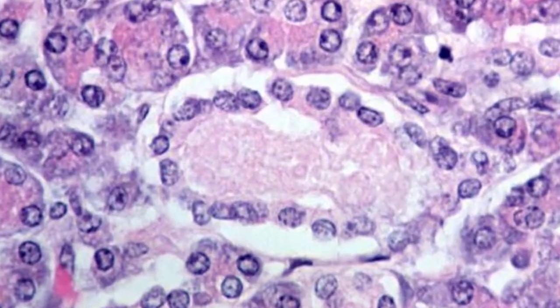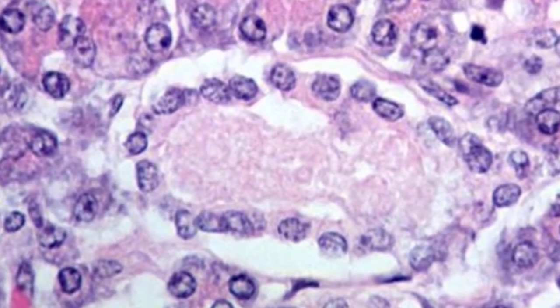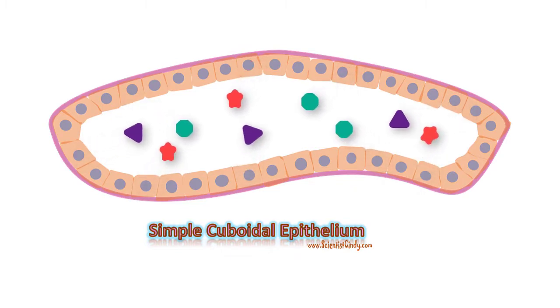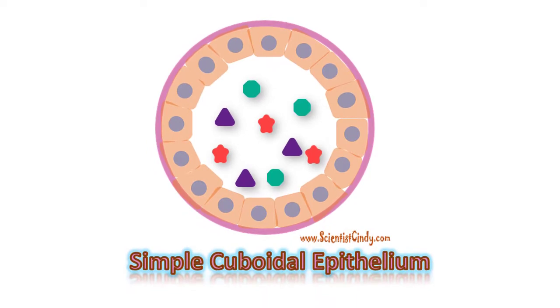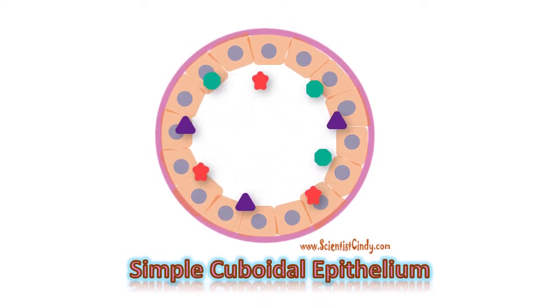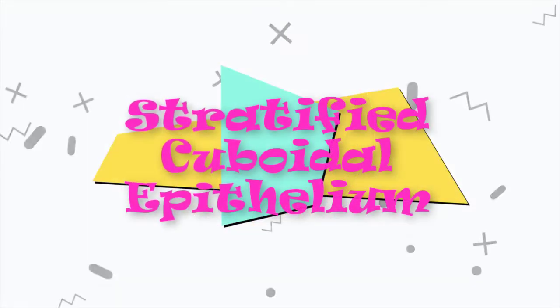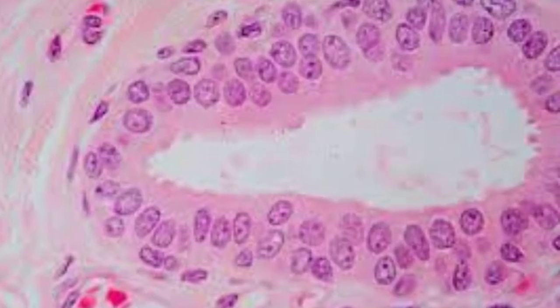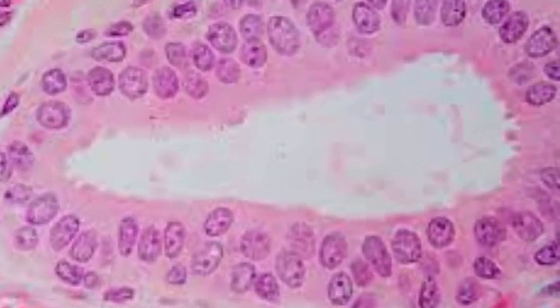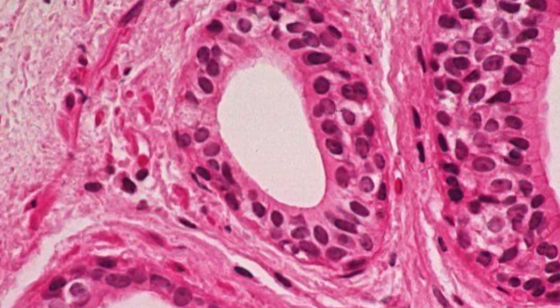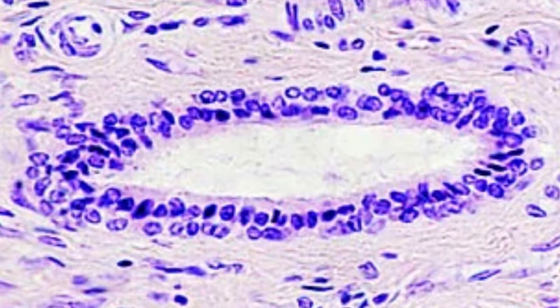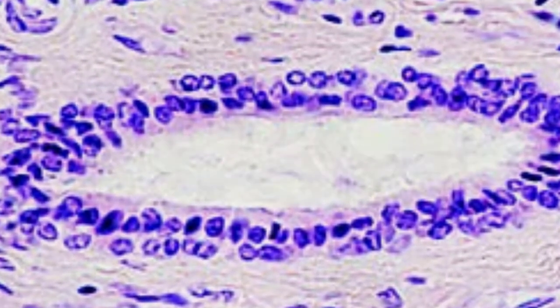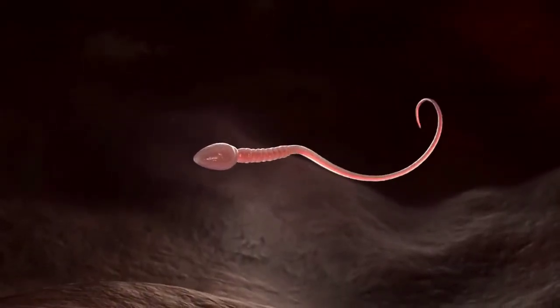This tissue type is specialized for secretion and absorption. Secretion is the process by which substances are released into the surrounding environment, whereas absorption is the taking up of substances from the surroundings or from the lumen. Stratified cuboidal epithelium forms the protective surfaces of some glands, such as sweat glands, mammary glands, and salivary glands. Here we see stratified cuboidal epithelium lining the walls of the seminiferous tubules of the testes, where spermatozoa are first formed.